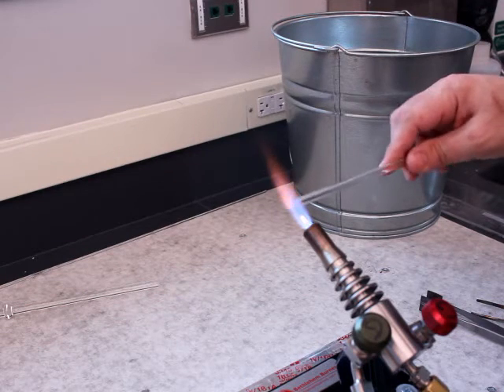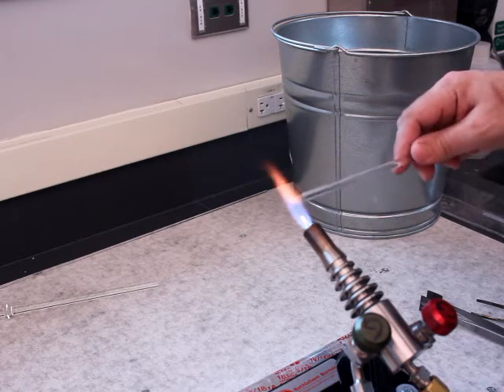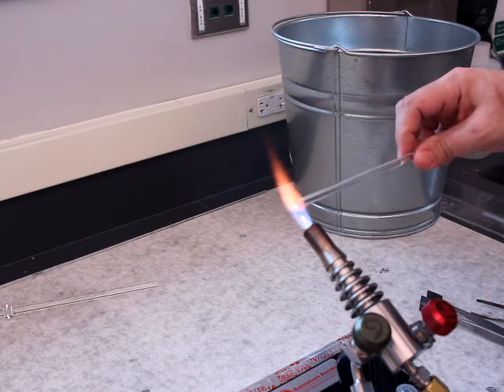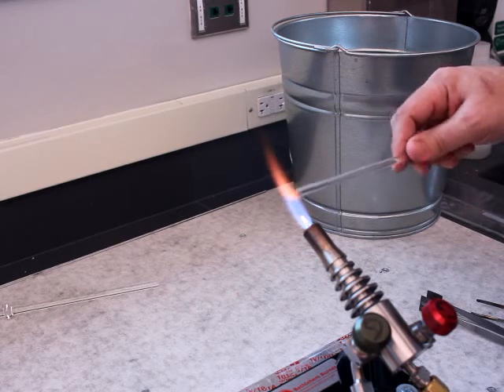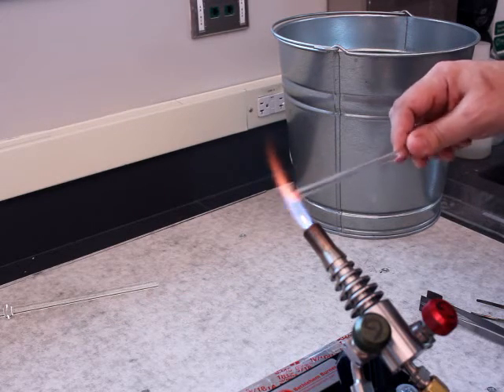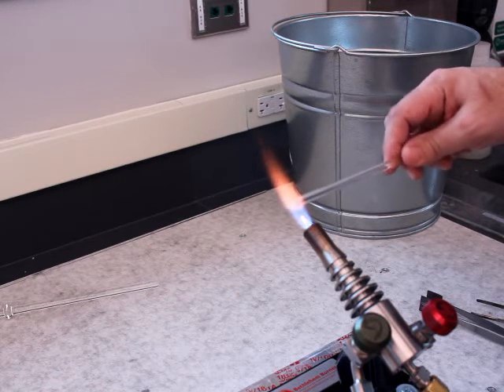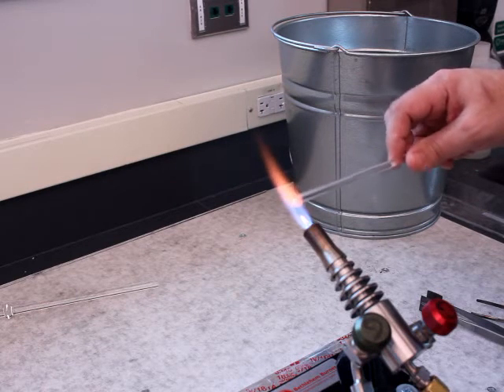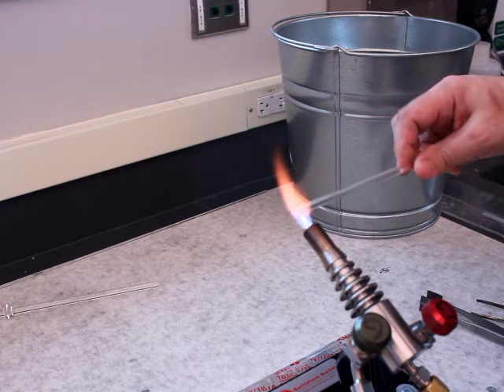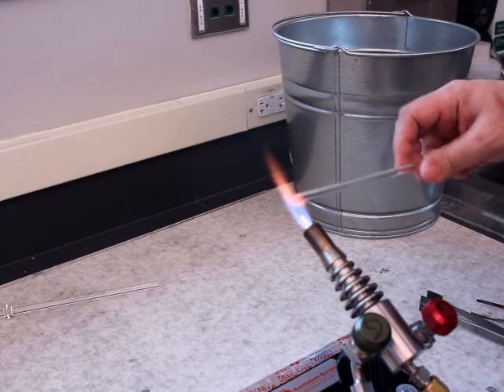This is a chore — anytime you get a shipment of glass you're usually having to cut it to length, whether with a glass cutter or purely with the flame, but fire polishing will be required. It's the kind of thing you'll practice a lot just out of necessity, but it is worth the time and trouble to get your technique as polished as possible. I'm trying to keep the heat on the very end of the rod so the gather doesn't get too big and out of control.